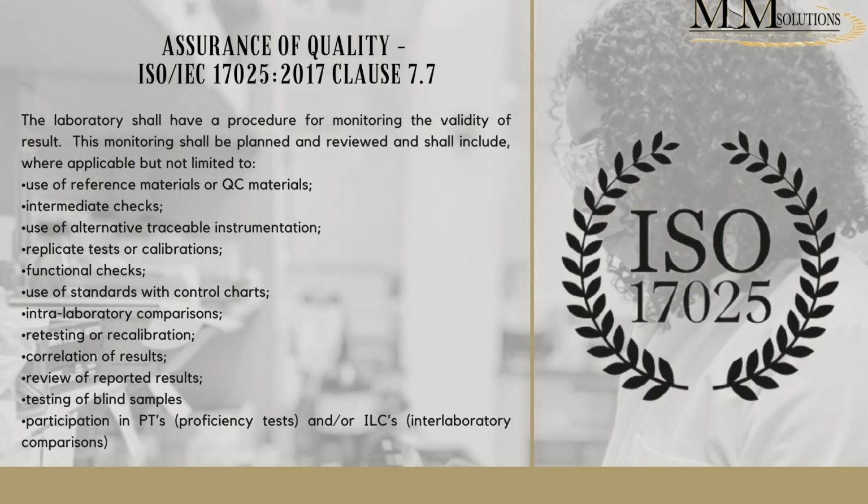In the previous slides, when I spoke a little bit about quality management systems, I introduced ISO IEC 17025, which is the standard specific to testing and calibration labs. If you look at the current version of the standard, which is the 2017 version, clause 7.7 is about assurance of quality. This clause is specific to assurance of quality of results.